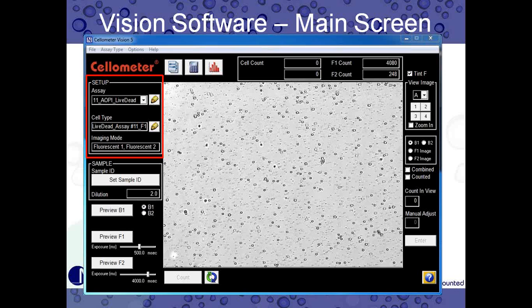One second. Just my screen. Okay, sorry.